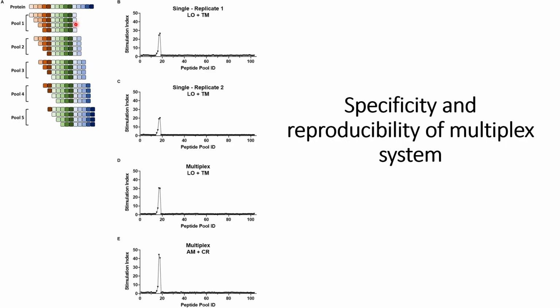The example protein that they took for their studies is pro-insulin, or immature insulin, which undergoes cleavage to become mature insulin. So they considered this immature insulin and created many pools of peptides, whose results we will see.